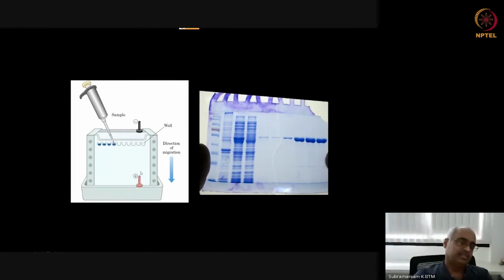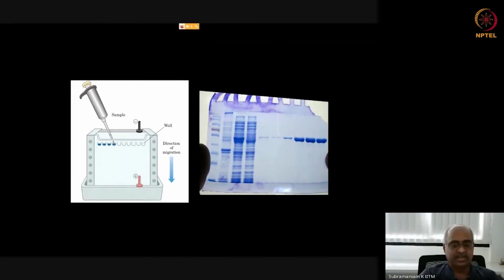So here, instead of melting something in buffer and pouring it in a tray and allowing it to solidify, it is actually a chemical reaction that makes a polymer from monomer. The monomer used is acrylamide, and it is not simply a long fiber. It gets cross-linked by the presence of bisacrylamide that can covalently link on either side to two growing chains of acrylamide polymer. And this cross-linked mesh-like structure is what finally is the gel.